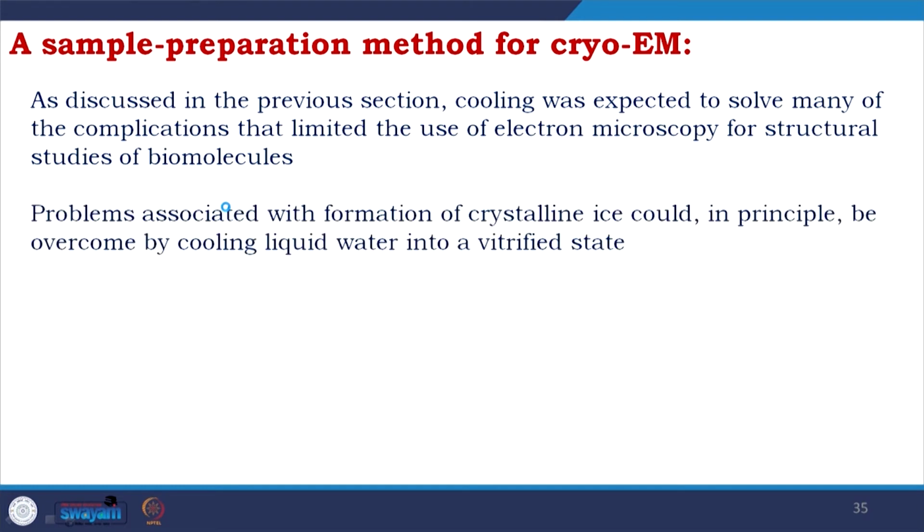The problem associated with the formation of crystalline ice could in principle be overcome by cooling liquid water into a vitrified state. So, cooling is one of the solutions, formation of ice is a problem. By development of vitrification, you could solve that.